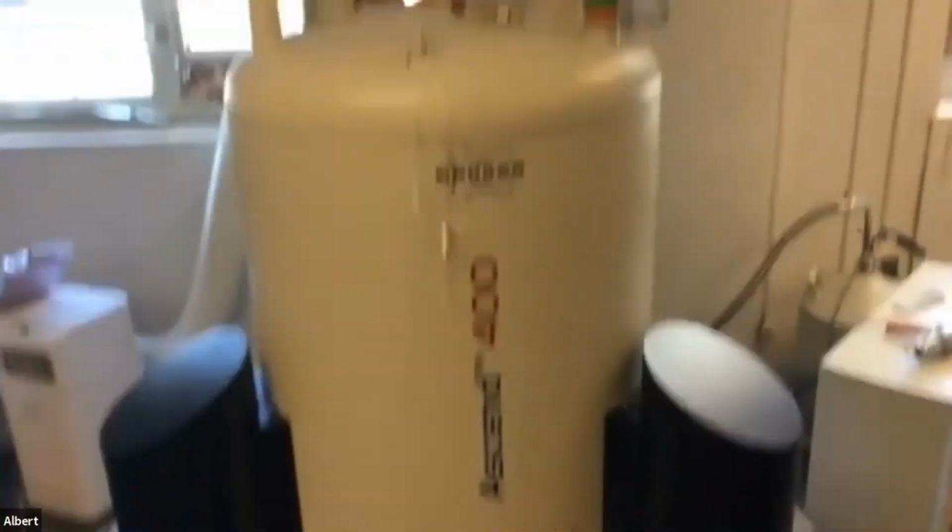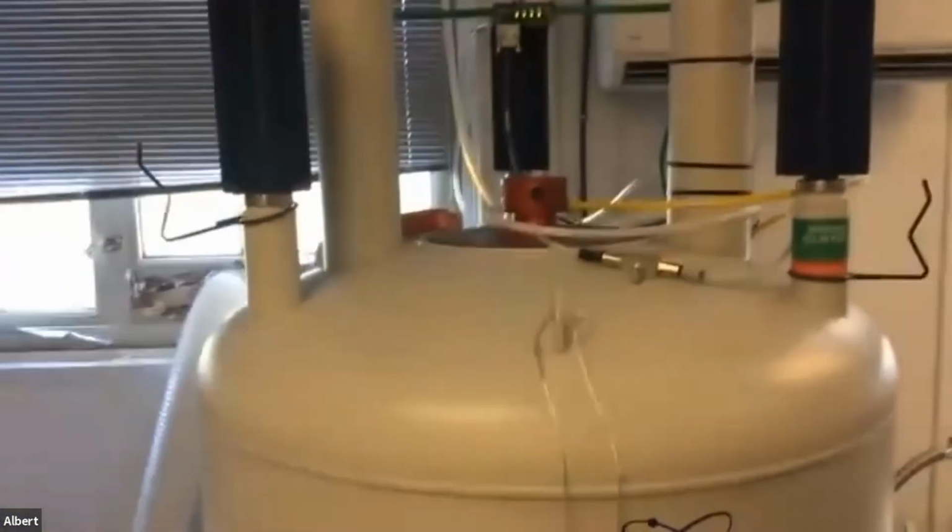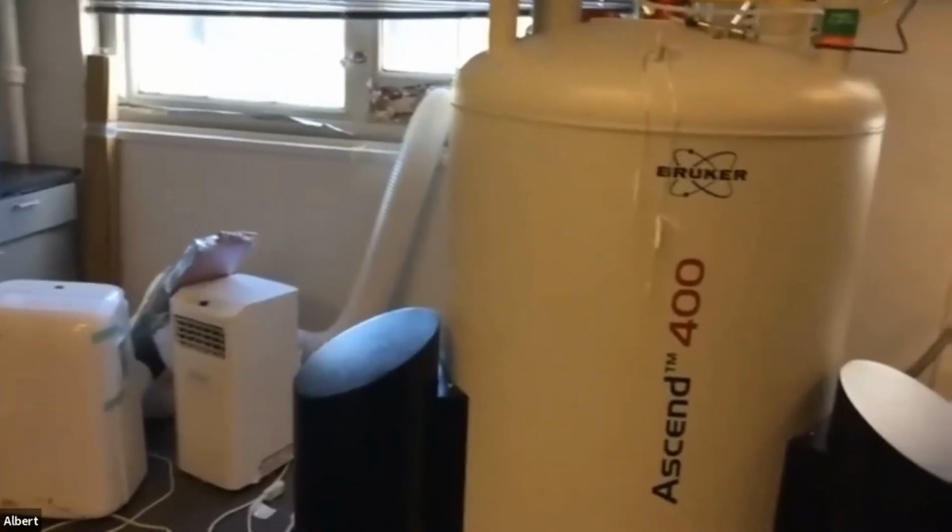It is a Bruker 400 megahertz. And you can see it has some little apertures on the top. Those are ports to fill it with liquid nitrogen on this side, liquid helium on the other side. And this is actually a giant magnet. It's a superconducting 400 megahertz magnet.